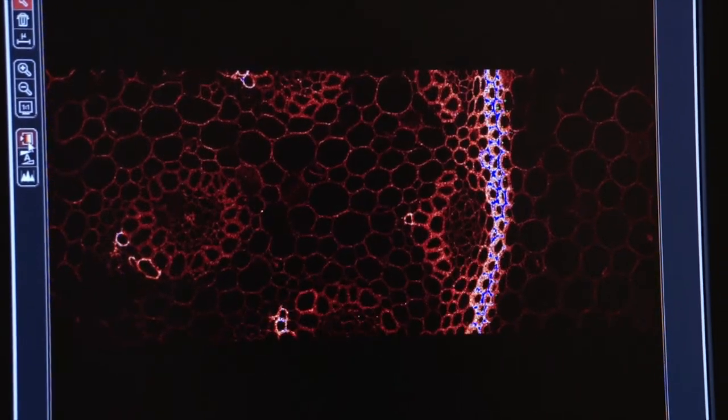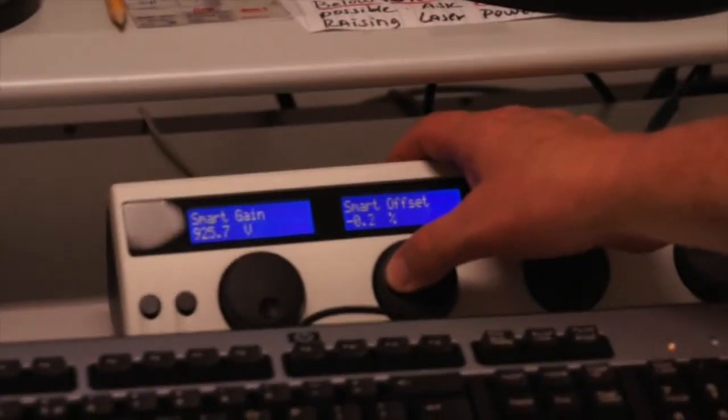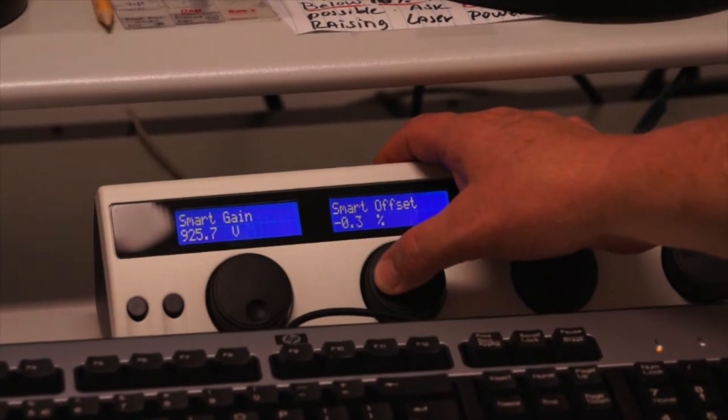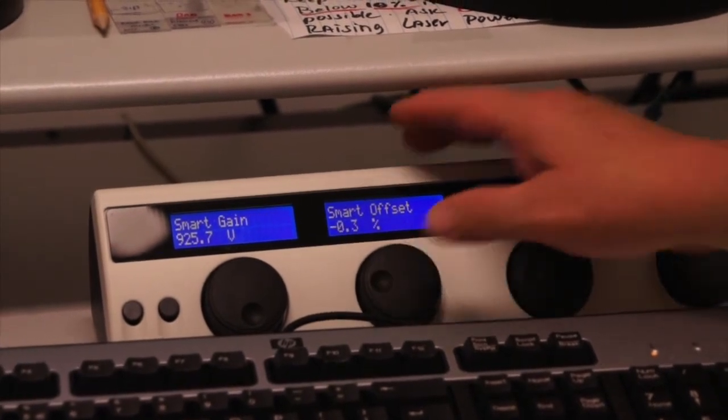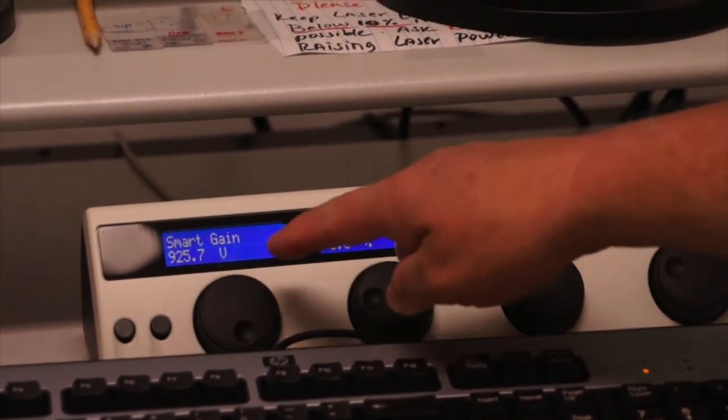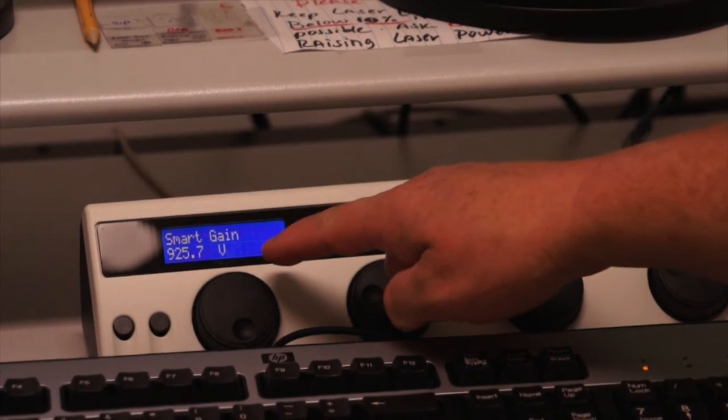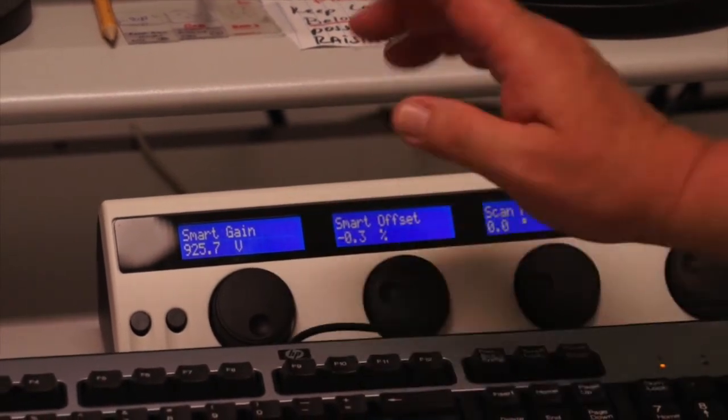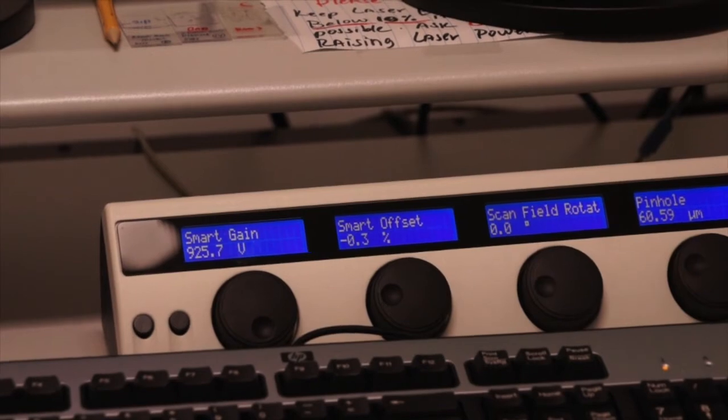And again, my offset is set pretty much where I want it, right at the point where the green pixels go away. So I have a smart gain of 925, which is where I should be for my laser power and a smart offset of minus 0.3.